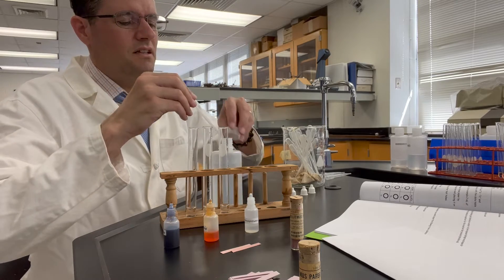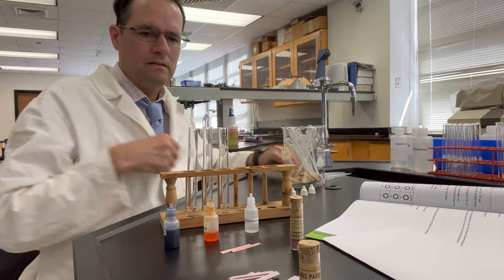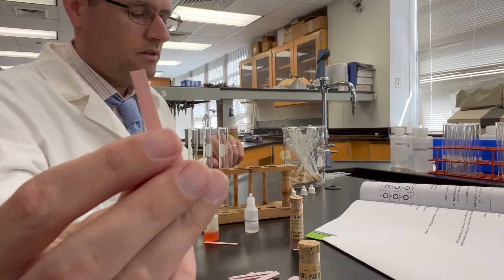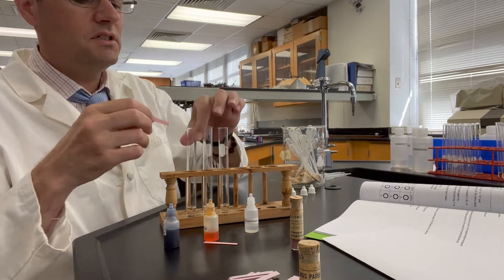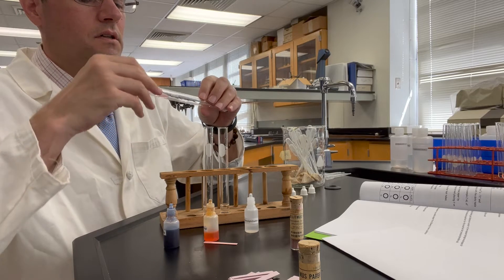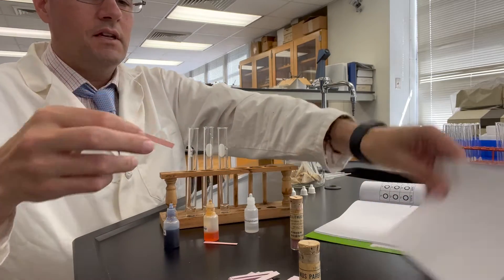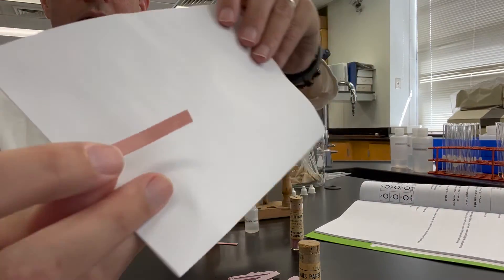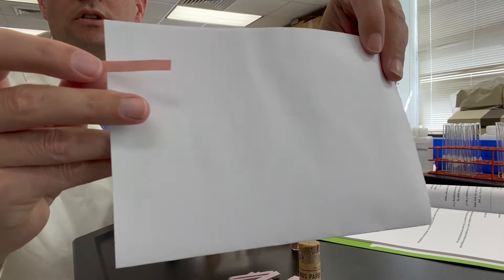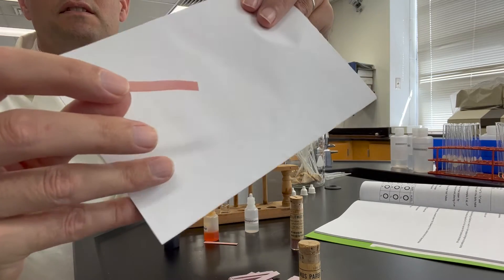Let's see what the litmus paper looks like first. Here's the red litmus paper to begin with, and we're going to place this into the ammonium chloride. Take a look. This is the tip that's been wetted in 0.1 molar ammonium chloride, so that's the color there.